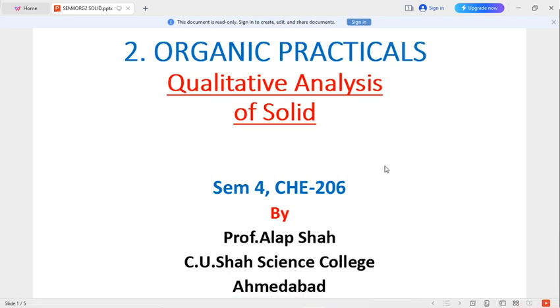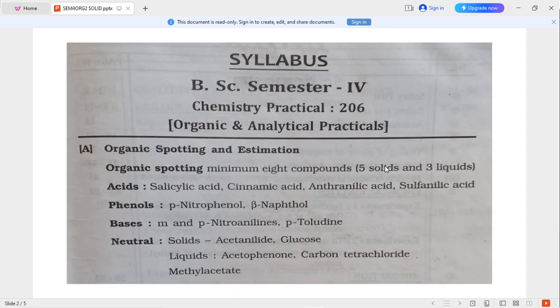In this video, we will discuss semester 4 organic qualitative analysis of solids. Dear friends, particularly in Gujarat University, the syllabus and the substances for the organic spotting are very limited. Already I have posted a video about liquids, and there are only three liquids: acetophenone, carbon tetrachloride, and methyl acetate. So you will find it in the playlist for the semester 4 practicals.